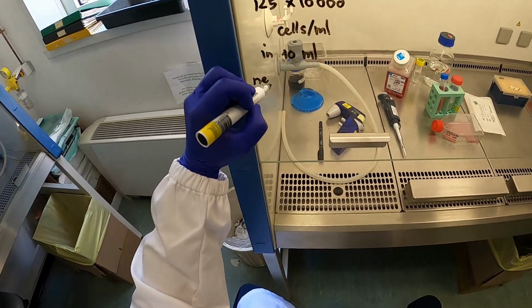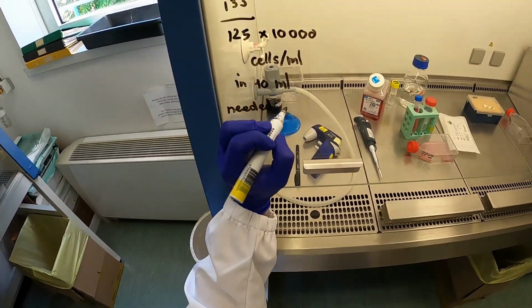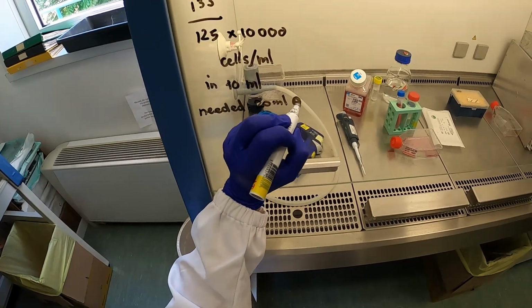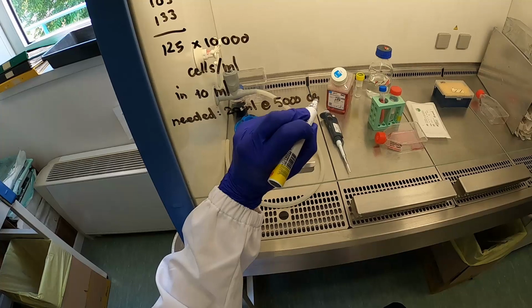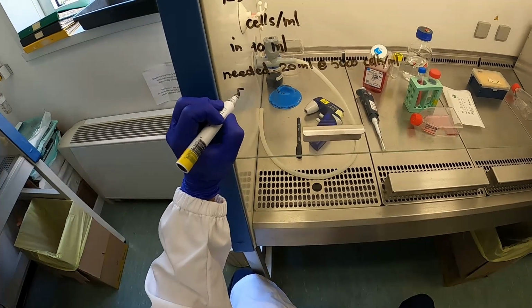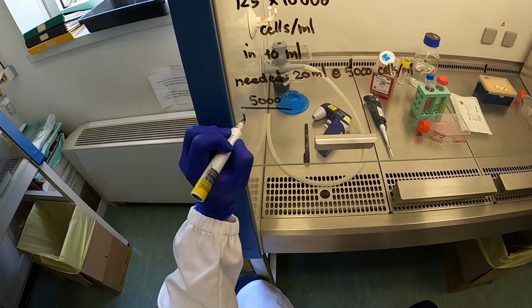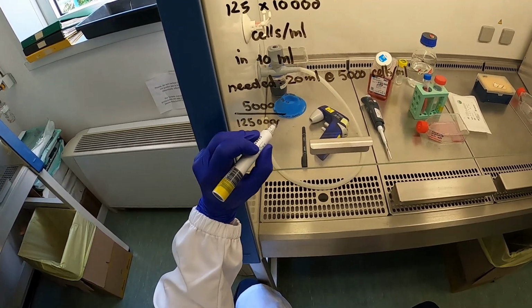Okay, now the important part. How much do we need to prepare? How much of the cell suspension do we need? So if we say that we want to introduce 1,000 cells per well, and we want to introduce that in 200 microliters, if 200 microliters contains 1,000 cells, then 1 ml would contain 5,000 cells. We will roughly make enough for 100 wells just to have a little bit of extra volume.